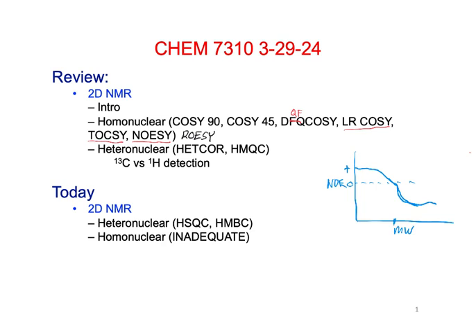So when we did the difference NOEs, if we subtract, then we got some positive signal. But if it gets above a certain molecular weight, or tumbling gets slowed down enough, then the NOEs become negative. And there's a point which often ends up being about 1,000 molecular weight, where the NOE goes through 0. What's the reason for that? I don't really know exactly. It's empirical, how the NOE is behaving. I'm sure there's a reason.